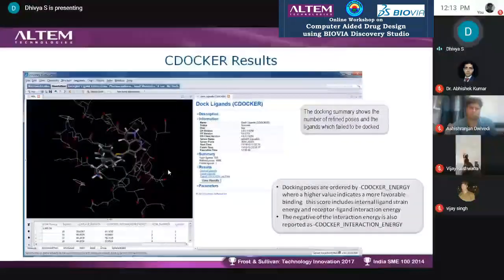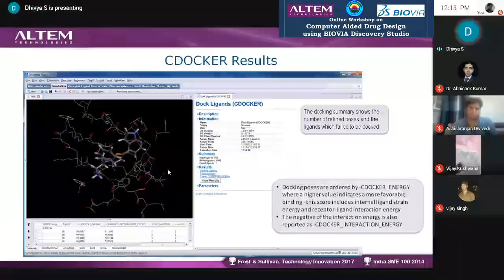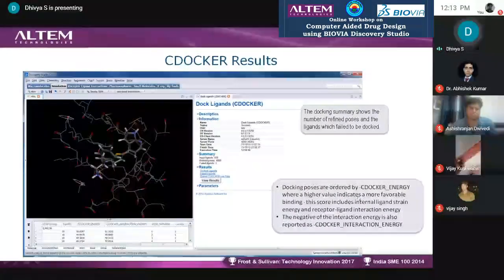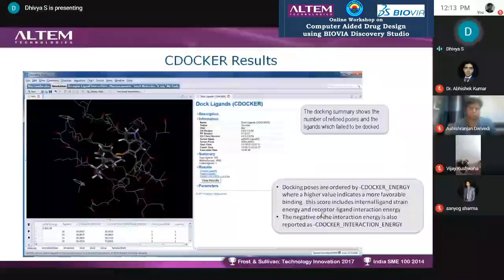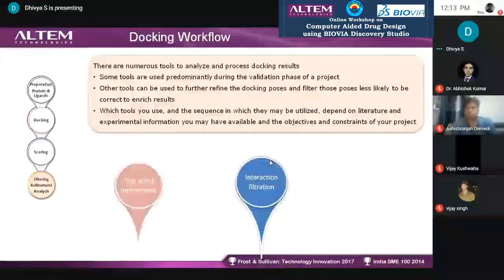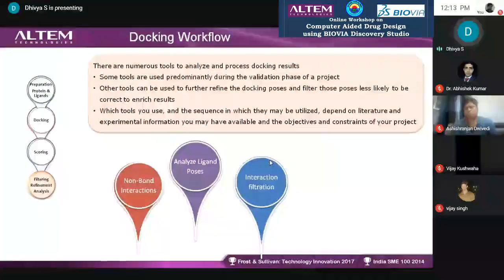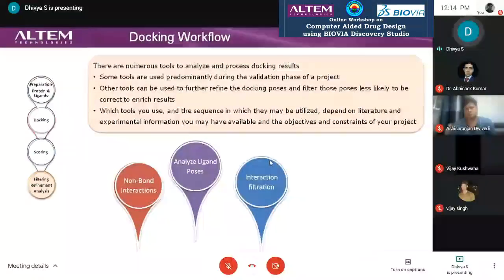We finally get results showing which poses docked and which failed, with all information available in the log results page. The CDocker energy value: the more negative (higher magnitude), the more favorable the interaction. Negative values are needed for scoring functions. Once you get results with many poses — even 700,000 — we cannot spend manual time analyzing them, so we use the Analyze Ligands tool for interaction filtration and non-bonding interaction analysis.